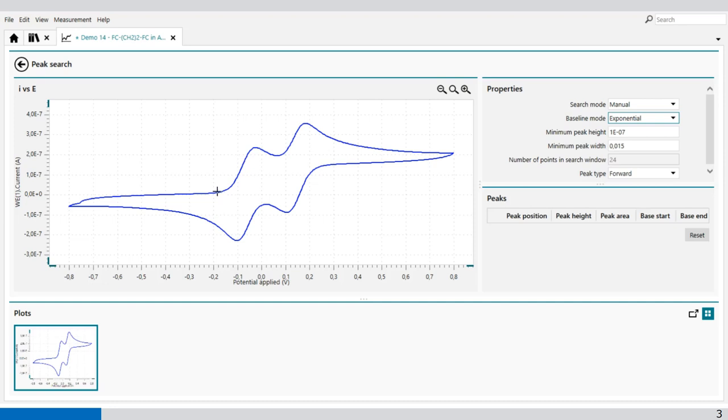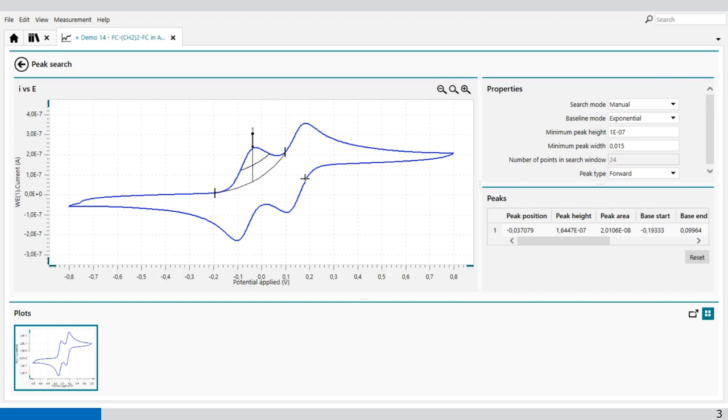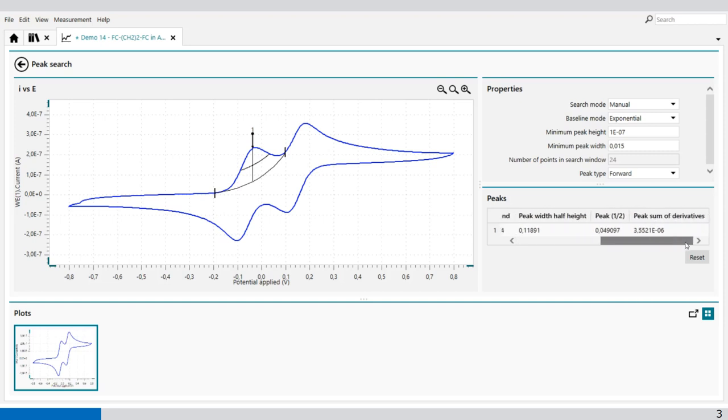With exponential you select one point on the graph, another point like this. And the software will create automatically an exponential baseline through the points. It will give you the peak position, the peak height, the peak area, the base start, and all other information regarding the peak.